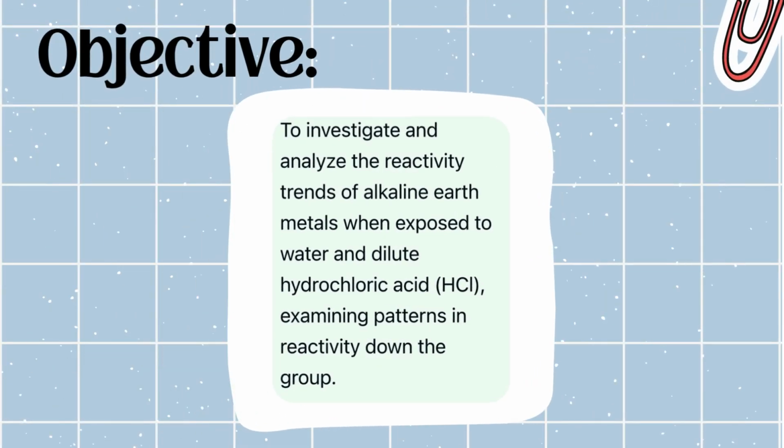The objectives in this topic are to investigate and analyze the reactivity trends of the alkaline earth metals when exposed to water and dilute hydrochloric acid, and examine the patterns in the reactivity down the group.